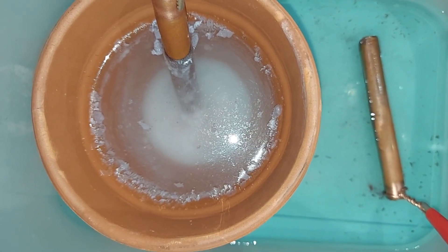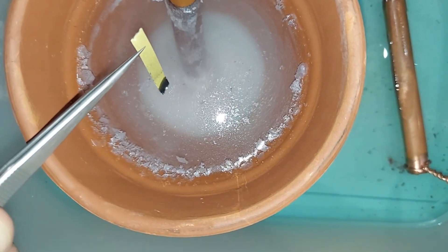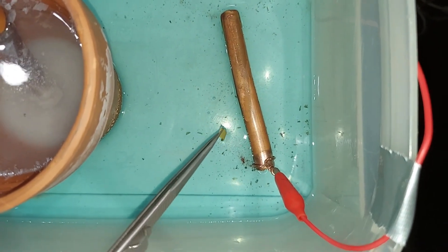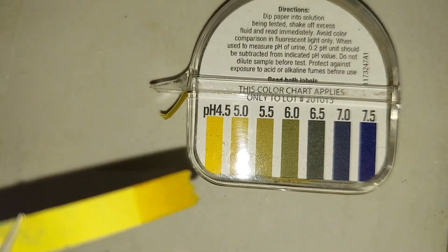Just to confirm what we're making is correct, we'll check the pH. The pH inside the pot should be basic — and sure is. The pH of the outer solution should be acidic — and sure is.